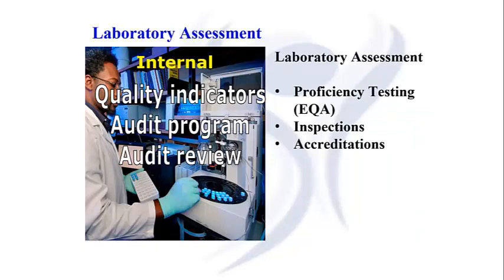Laboratory assessment. The process of assessment is a tool for examining laboratory performance and comparing it to standards or benchmarks, or the performance of other laboratories.